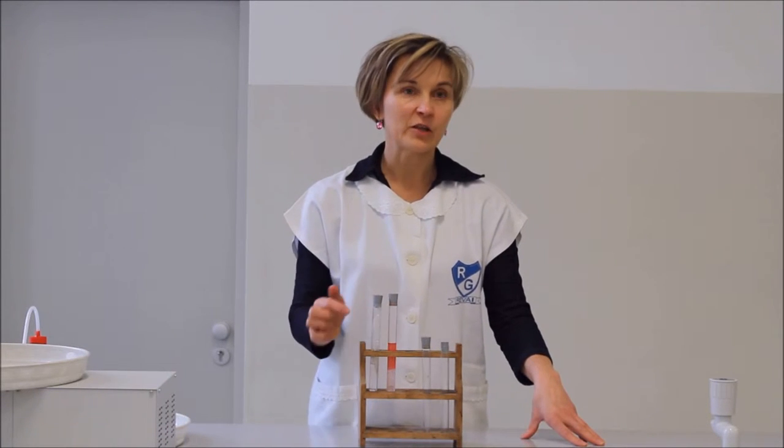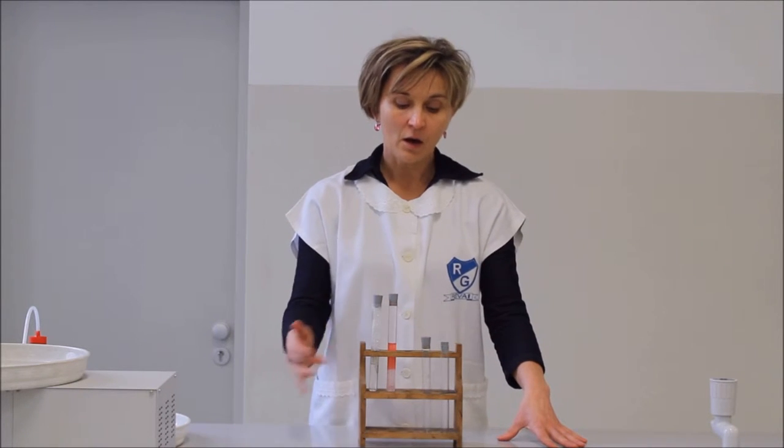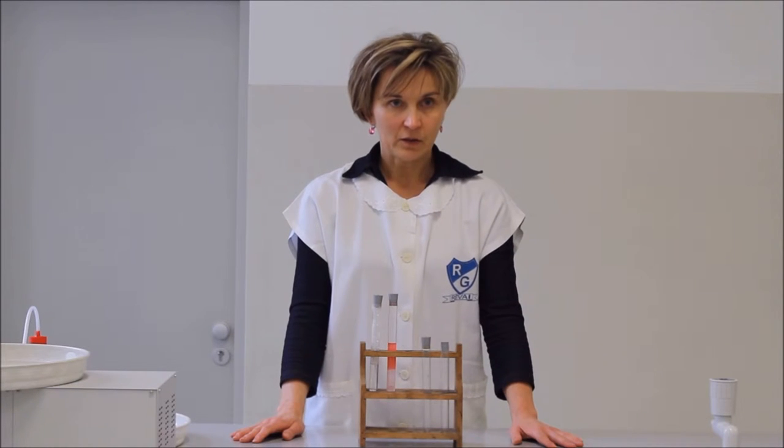A sudán 3-festék, mivel egy apoláris festékmolekula, az étolajban fog jobban oldódni, mint a vízben. Ezért a felső folyadékfázis lesz a sötétebb, vörösebb színű. Az alsó vízes fázis pedig minimális mennyiségben tartalmazza csak a sudán 3-festéket. Ezzel azt is kimutattuk, hogy az olaj sűrűsége kisebb, mint a vízé, és a víz tetején fog elhelyezkedni az olajréteg.